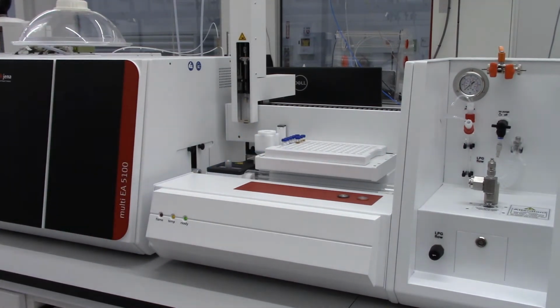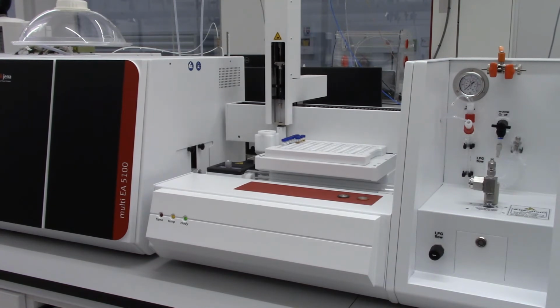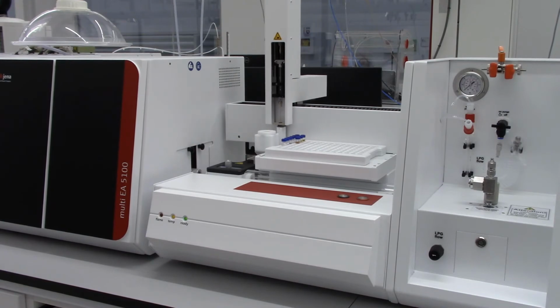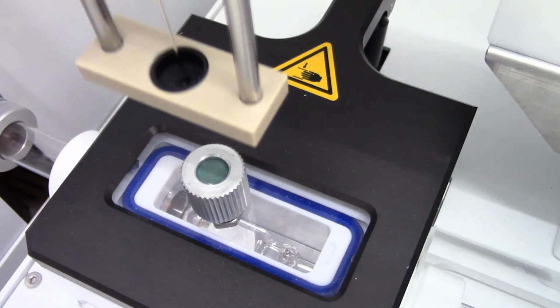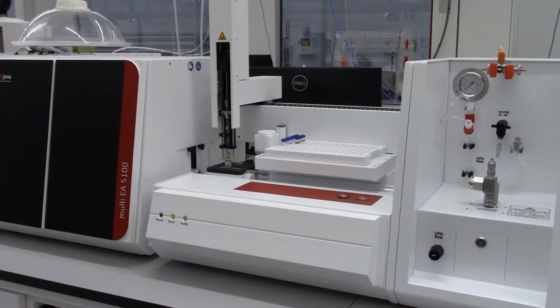At first, the multi-matrix sampler will do a number of rinse cycles, discarding the sample into the waste port. Then the sample is slowly drawn up into the syringe and injected onto the quartz boats for horizontal combustion. The injection port is cooled to prevent the evaporation of volatile sample components. Now the quartz boat is introduced into the combustion furnace, and we can monitor how the signals develop for the different elements during the combustion in the software.